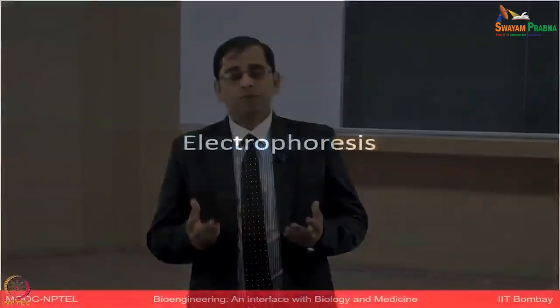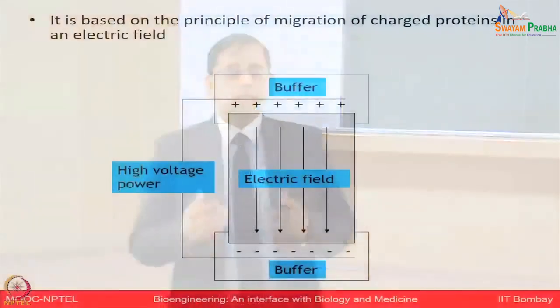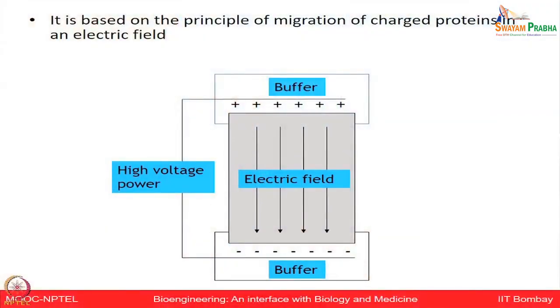Today we are going to talk about basic electrophoretic techniques to separate proteins and study proteins. So, what is electrophoresis? It is one of the powerful techniques for protein separation, and the separated proteins can be visualized after subsequent staining steps. It is based on the principle of migration of the charged proteins in the electrical field.